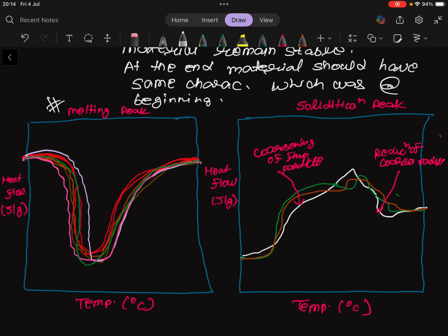If we look at the solidification curves, we notice something strange. Typically when we have DSC, we have temperature and enthalpy of melting. Now if we reverse the temperature, we have solidification, and we can have a change in the degree of undercooling. The solidification of tin inside aluminum is related to different crystallographic orientations. If liquid tin interacts with aluminum having a specific orientation, it will solidify in different ways.